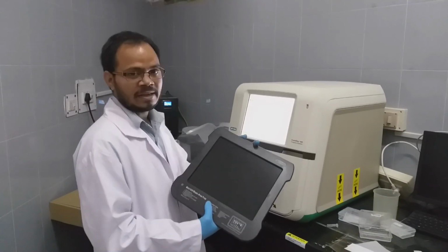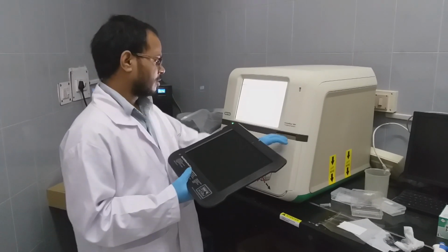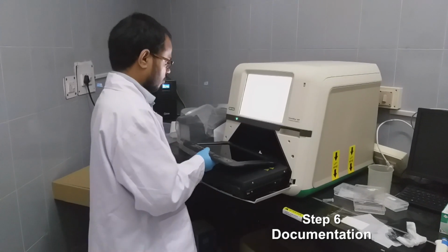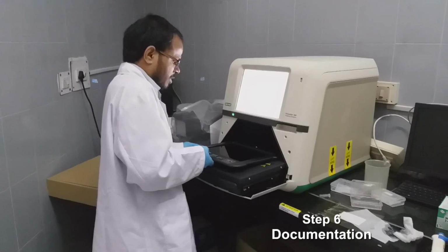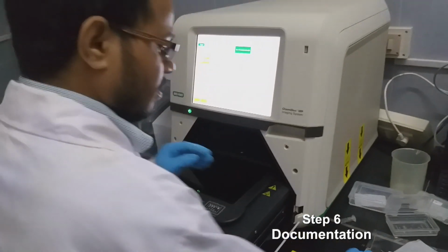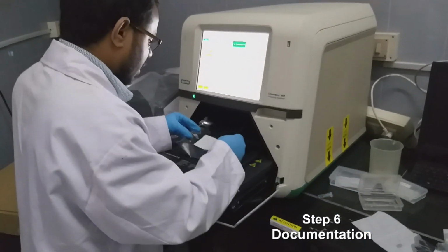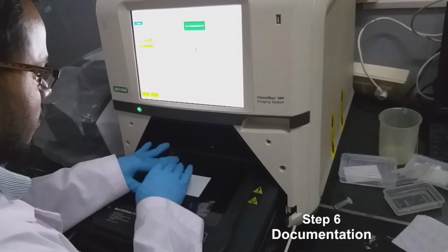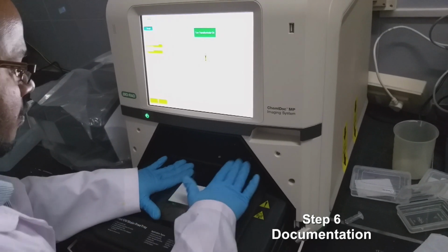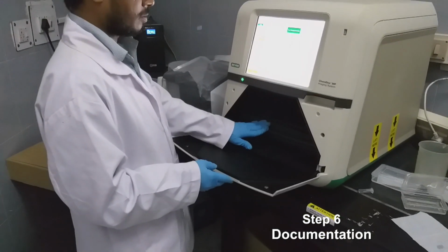This is the tray we use for developing the blot. We open the system, properly align the tray and then shift the blot onto the tray. Once it is over, you just close it.